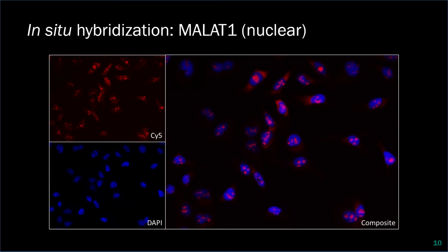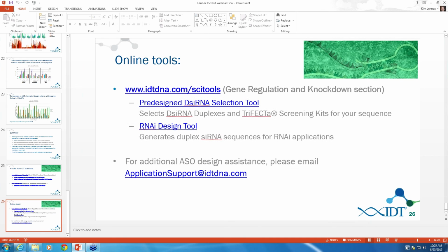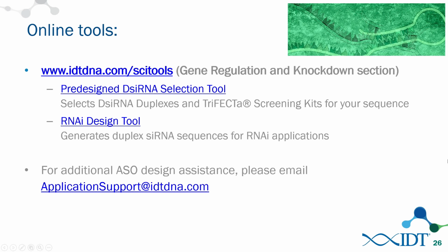And I'm going to ask one more question, and I think this gets us through the very great majority of these, which is, have you tried targeting introns using antisense oligo? I have not tried targeting introns using antisense oligos. Although it's been done more successfully, I was actually trying to find whether an RNAi has been able to target introns, because there's been a couple publications in 2002 and 2003 which show that they have not been able to target introns with RNAi. But as far as antisense goes, I have not, but I wouldn't think that there would be any complications with that.